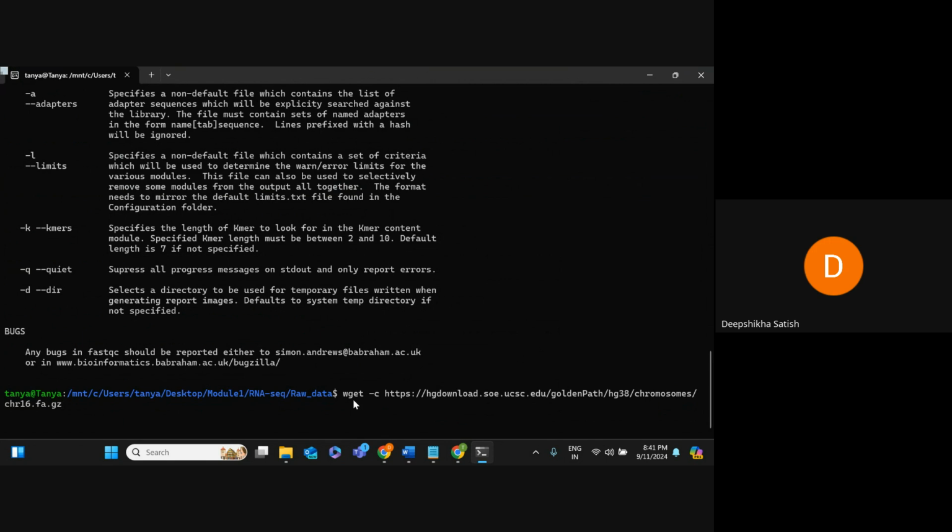Did you get it? Why are we downloading only chromosome 16, not the entire genome of human? Everyone, is it clear? Yes, ma'am. Okay. Just try to download this chromosome 16.